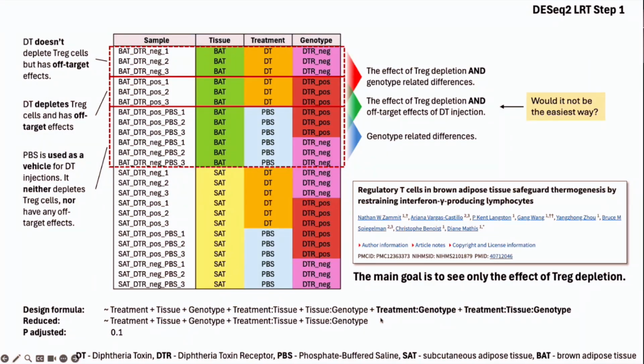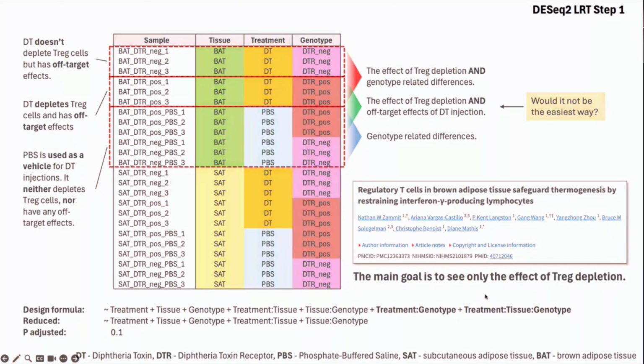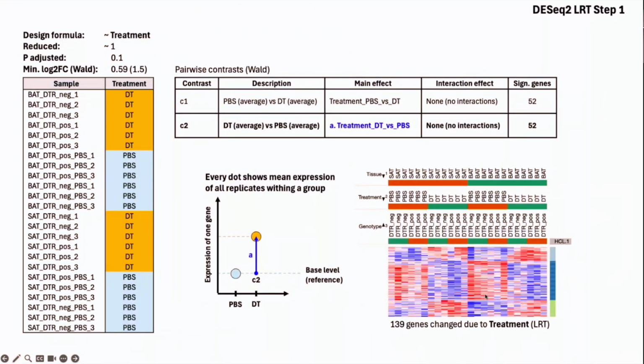This looks a bit difficult. Why exactly I selected this formula and why exactly this term answers the question. In order to explain it, we will use exactly the same data set, but we will go from a very simple metadata to more complex, and I will explain what happens in DESeq on every step when we make the design and metadata more and more complex.